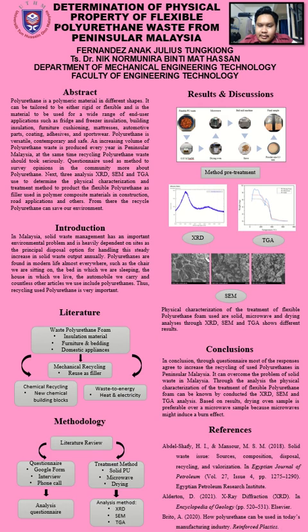So this is the same analysis, where we can see the solid is more different compared to microwave and drying oven, but these two samples, microwave and drying oven, are almost the same. Which means that the samples for comparison between microwave and drying oven are in powder form, as I said before.